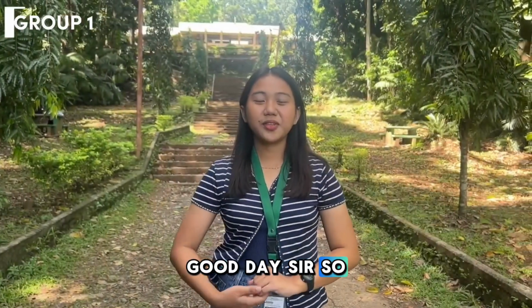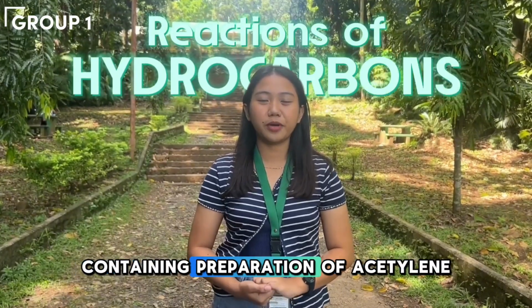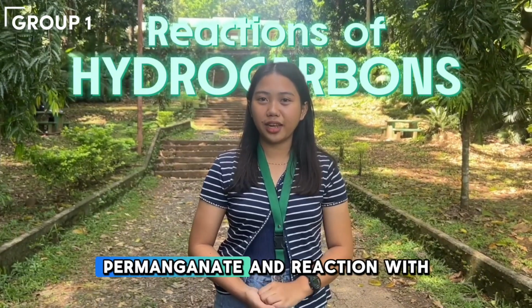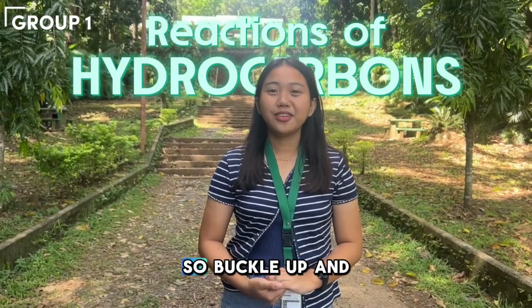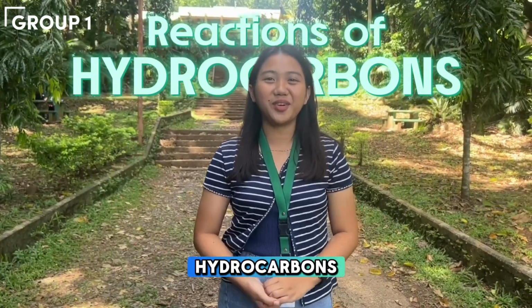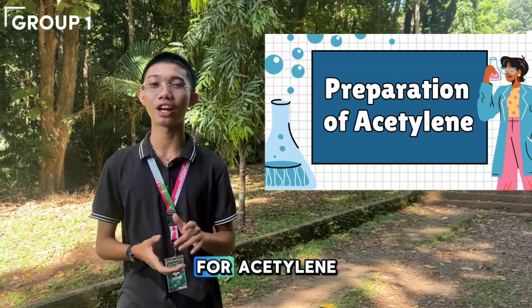Good day, sir. So today, we will discuss the reactions of hydrocarbons containing preparation of acetylene, ethylene, reaction with potassium permanganate, and reaction with iodine. So buckle up and enjoy the ride as we dive deep into the wonders of hydrocarbons. And so let us begin with the preparation for acetylene.